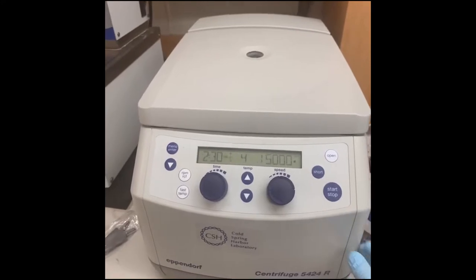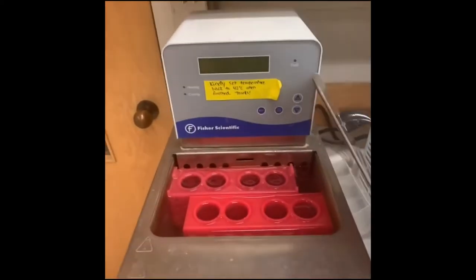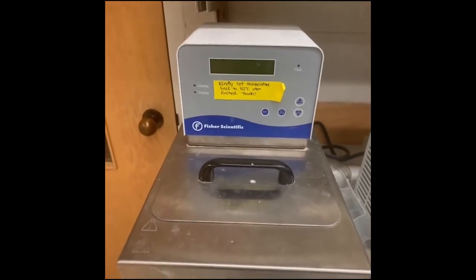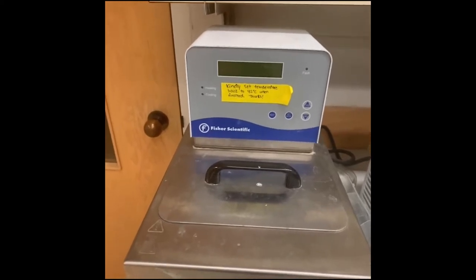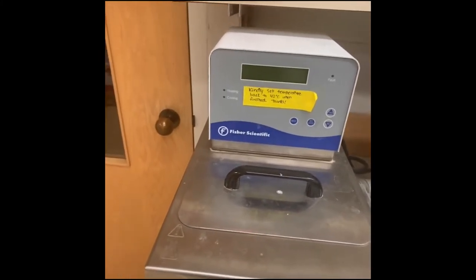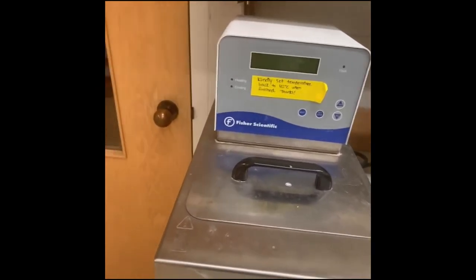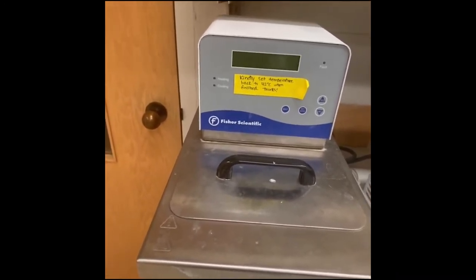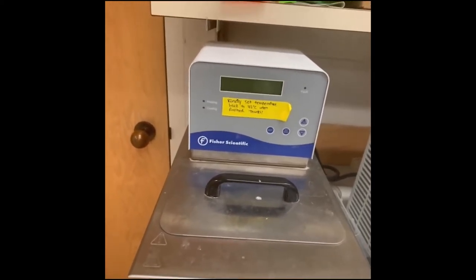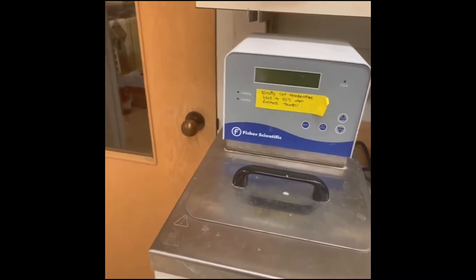We also have a lot bigger centrifuges I'll get to in a bit. Moving this way, this is our water bath. We use this a lot for thawing cell pellets and doing transformations, where you heat shock bacteria to get them to take in a plasmid DNA. It's at the end of my bench so I often think people are coming to see me when really they're just coming to do the transformations — I seem very popular but it's just the water bath. The water bath also makes really loud growling noises when it's running low on water, so if that happens, fill it.